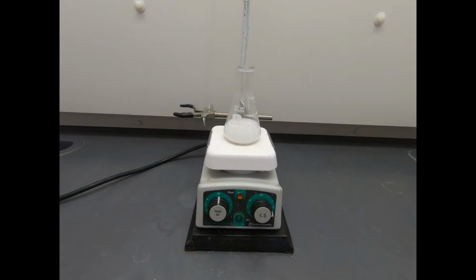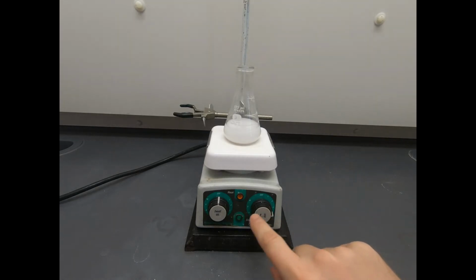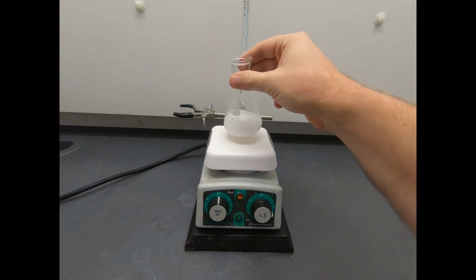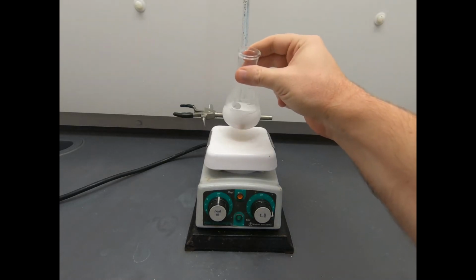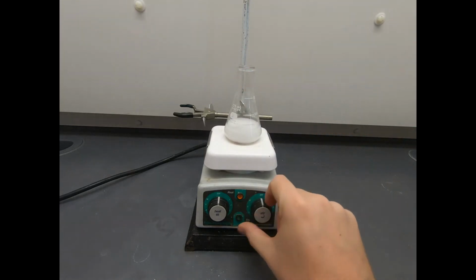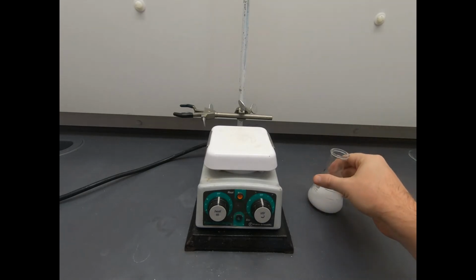Okay, this has been stirring now for about 30 minutes. Note that it is only stirring. The stirrer is on. We don't have any heat. And presumably what we've done is we've extracted all the aspirin out of that solid material and into the isopropanol. Note there is a stir bar in there and we are agitating the solution. So let's go ahead and take this off of the stir plate.